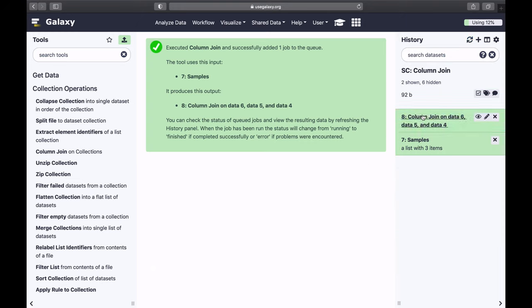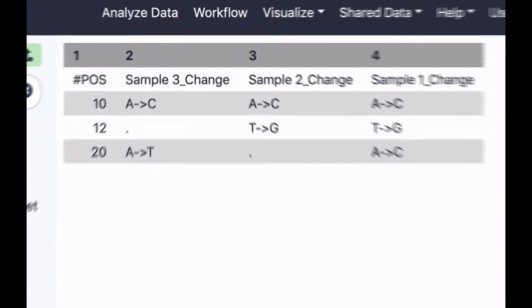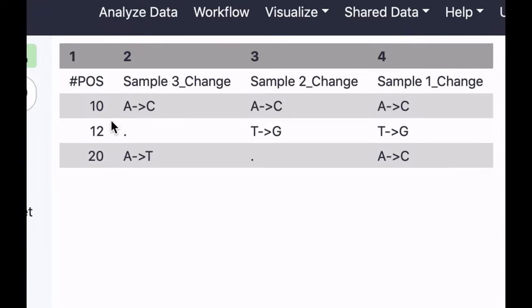In the end we're going to get just one dataset, and let's see how it looks like. So you can see that we have three positions, because this is the union of positions in all three samples, and for each dataset we have changes.